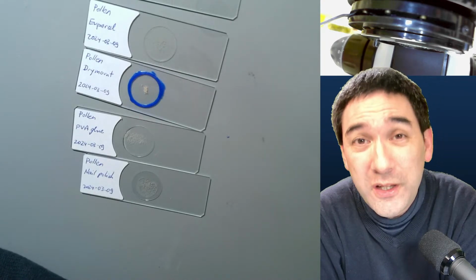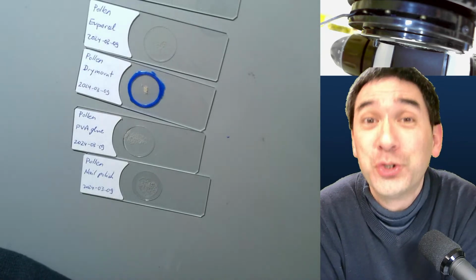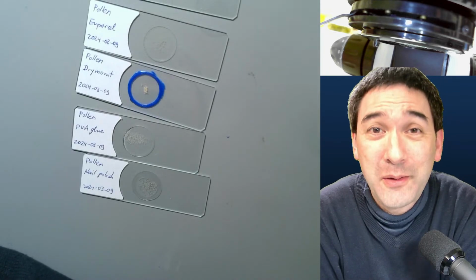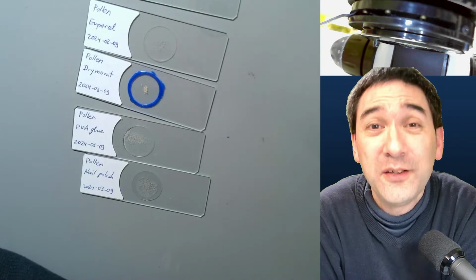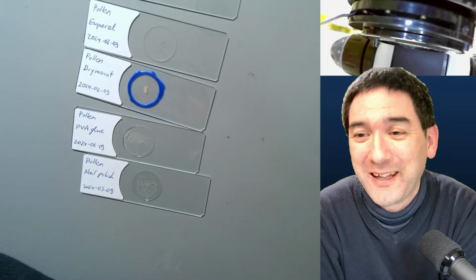You crush a wheat grain between 2 spoons, and then you drop it in there, and then you should have a lot of ciliates, Paramecia, and so on. It always worked, but this time not at all. And I think the reason could be that there might be some water crustaceans, water fleas in there as well, and they have eaten them up, so I have to restart again.